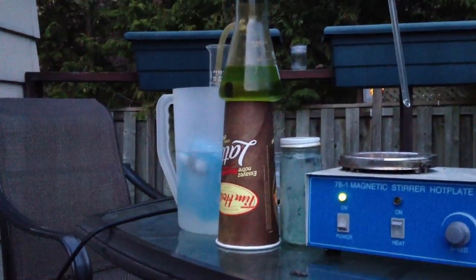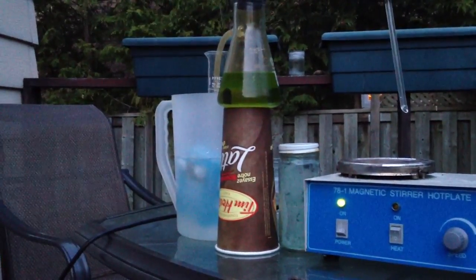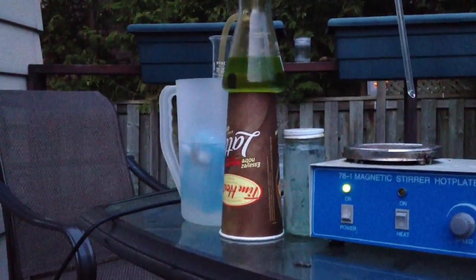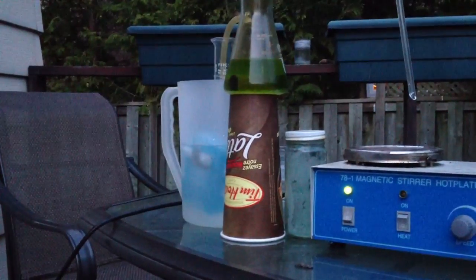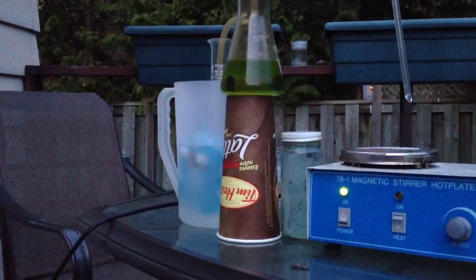This time I actually really thoroughly dissolved it — there was nothing left to dissolve. I made a saturated solution of that, or pretty close to it. And in the graduated cylinder behind it, I have 30 milliliters of 35% hydrogen peroxide.